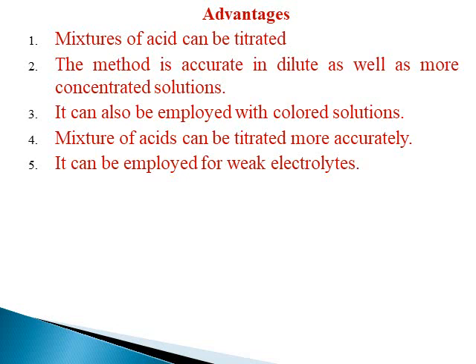It can also be employed for colored solutions. Mixtures of acids can be titrated more accurately, and it can be employed for weak electrolytes. So these are some of the advantages of conductometric titrations.